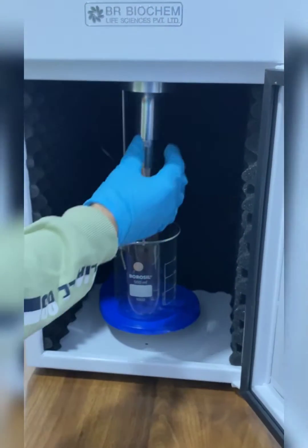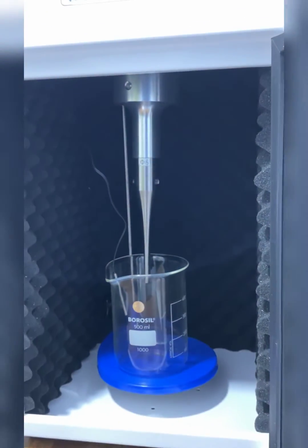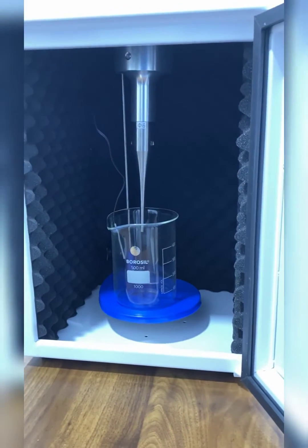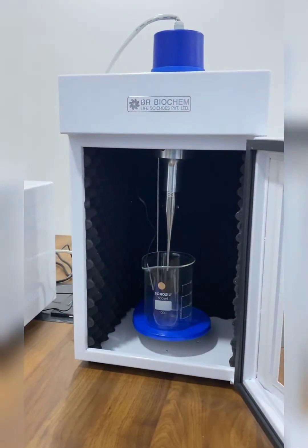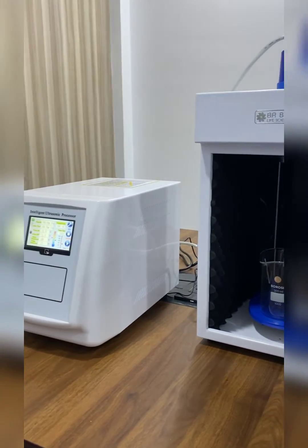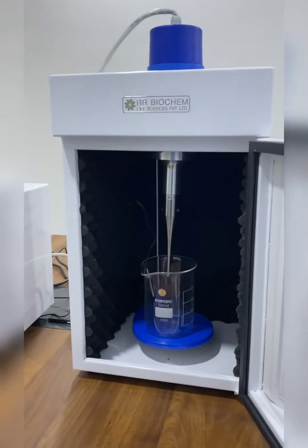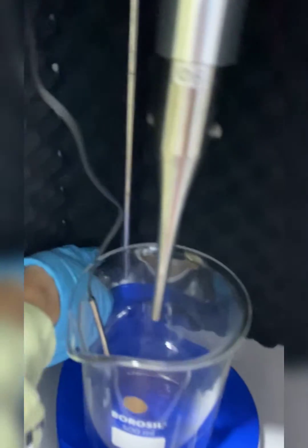This is the titanium tip of this ultrasonic homogenizer. We have different ranges of titanium tips — for example, dia 2 mm, dia 3 mm, dia 6 mm, dia 10 mm, and dia 12 mm. This is the movable clamp of this ultrasonic homogenizer. You can adjust the clamp size according to your need. This is the temperature sensor.